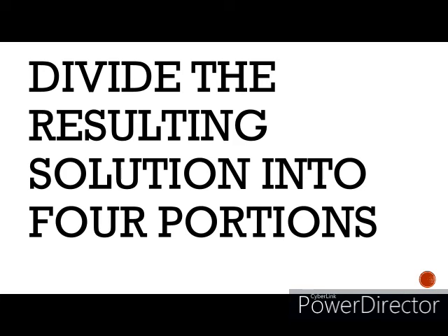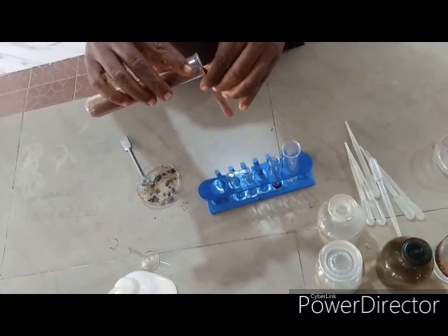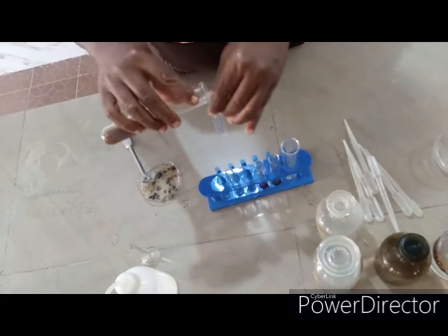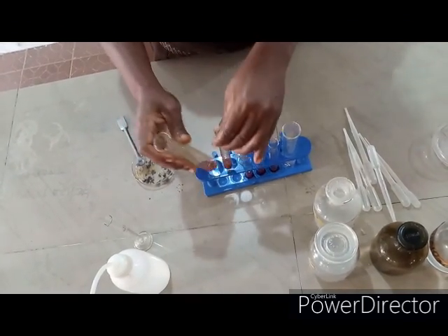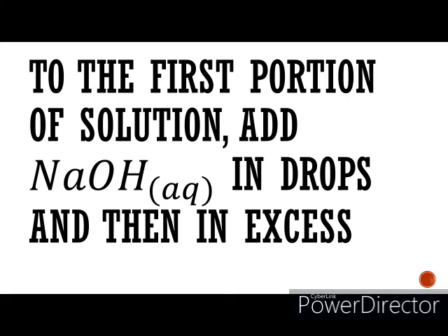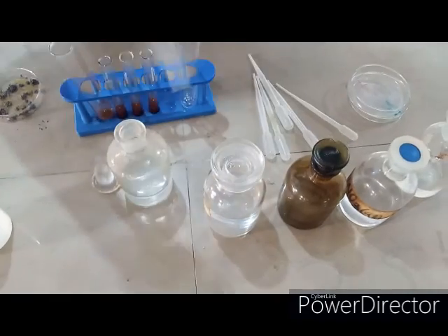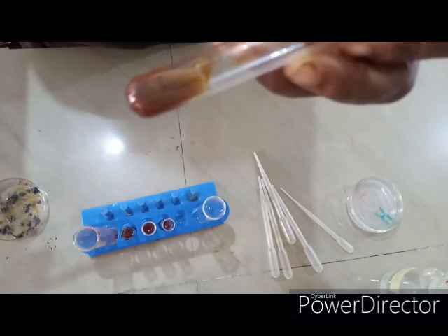Divide the resulting solution into four portions — this is the second portion, this is the third portion, and this is the fourth portion. Let's follow the instruction from the question. To the first portion of the solution, add sodium hydroxide in drops and then in excess. Tilt your test tube to see whether the precipitate is gelatinous or not. You can see that we have a reddish brown gelatinous precipitate.